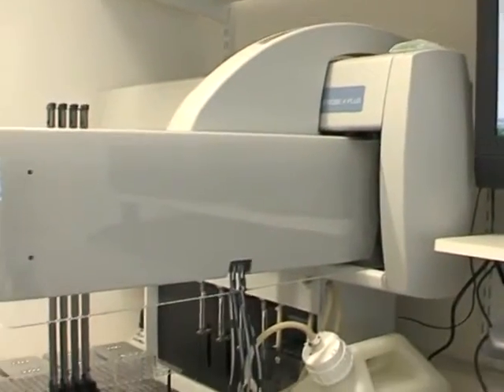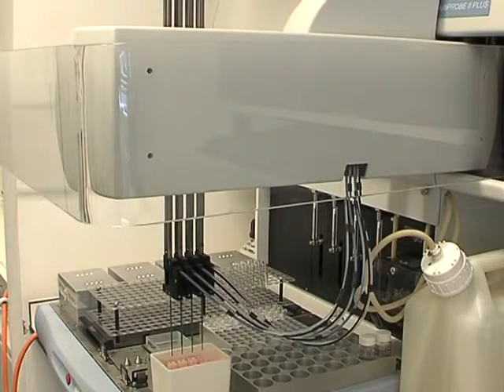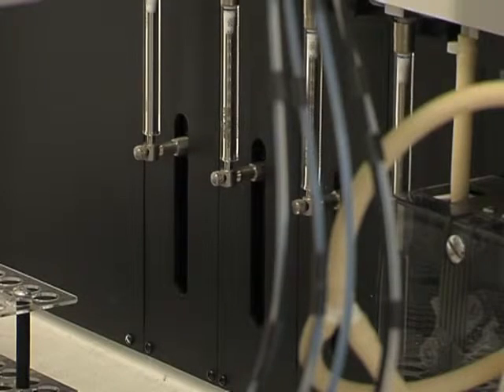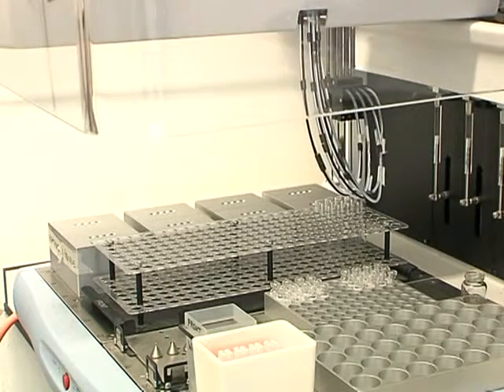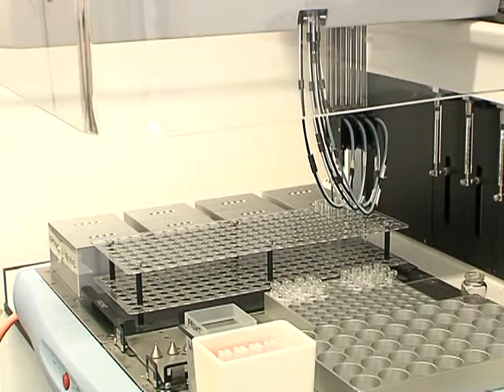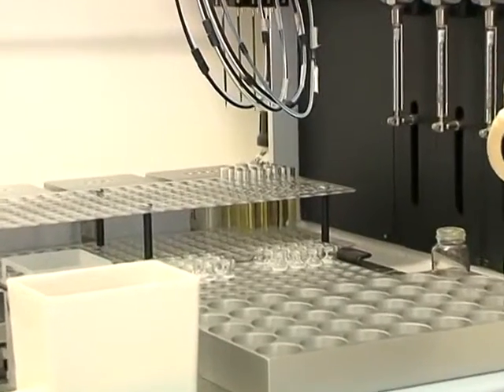After phase separation, samples are taken from the top and bottom phases, analyzed by an appropriate assay, which is frequently HPLC or gas chromatography, and distribution ratios calculated from the peaks detected in each solvent system. The whole process takes several hours, depending primarily on the length of each analysis assay. But its automated nature means it can operate unattended, even overnight, and the operator need only look through the data to determine the best solvent system to use.